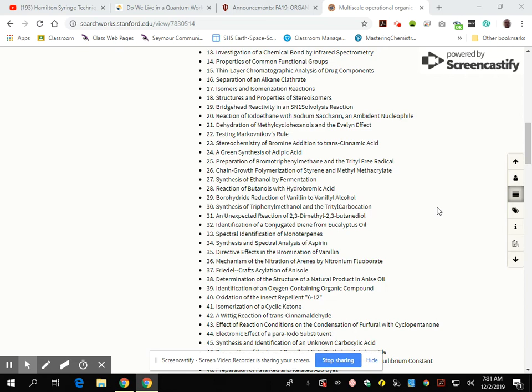And the spectrometer will give you a reading of where the compounds are absorbing, or actually you will see a small spectrum of the compound. And when you see the spectrum of the compound, you will then go calculate by our methods where the lambda max should have been. You're going to make a comparison of them. That's going to be the entire report. You're just going to show me your calculation.